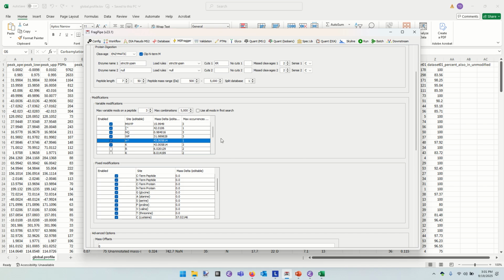Yeah. Okay. So you can see that I've been doing this stuff for 20 years. I still get confused at the syntax different people use for this. For me, separating the carbamylations to two separate lines just made sure I was getting what I had tried for. I hope. I mean, we'll see how the search goes. These others are not checked, so they're not live.